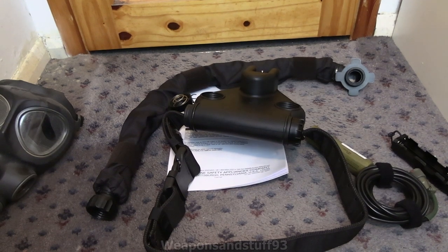Today I'm going to take a look at a C420 PAPR unit. The C420 is basically the NATO gold standard, the Western countries gold standard PAPR unit.